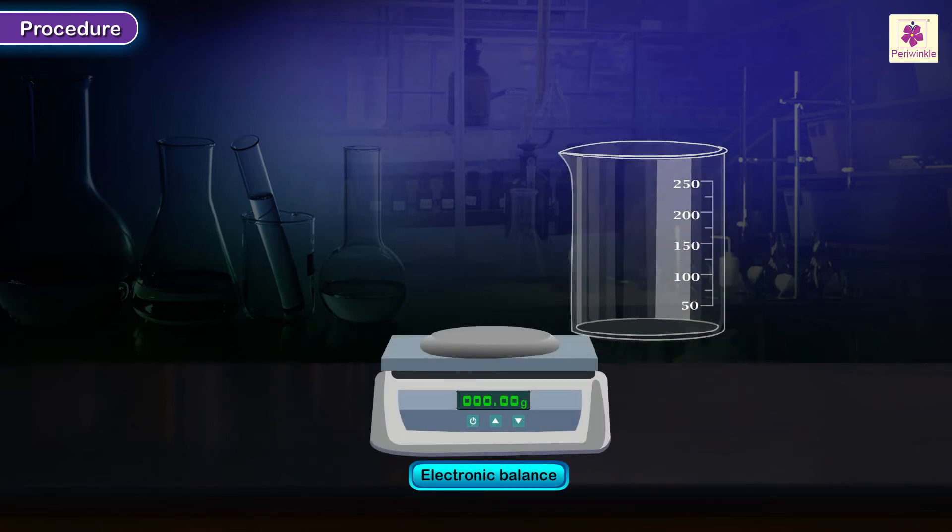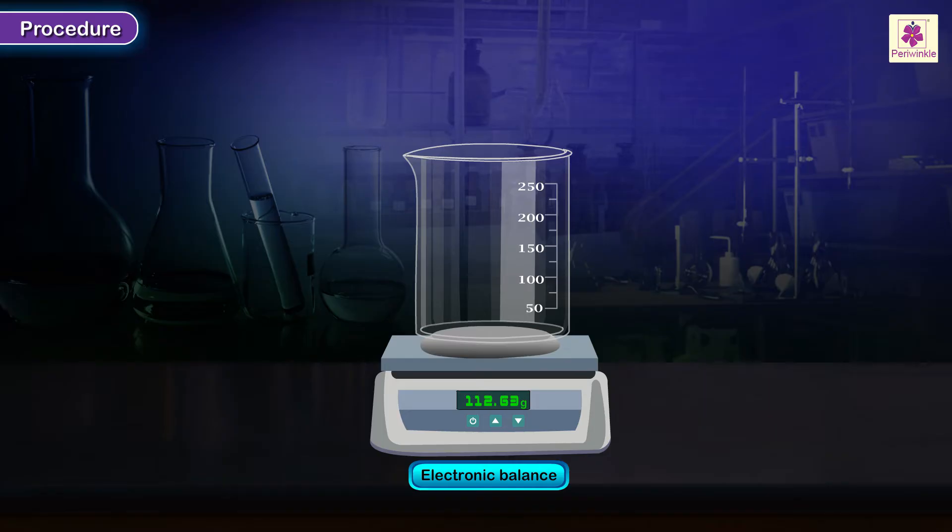Weigh the empty 250 ml beaker on the electronic balance.